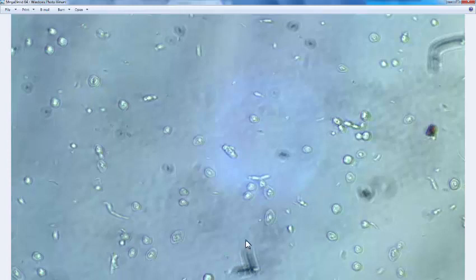probably, brewing or Saccharomyces type yeast, possibly there. A bit of a different style or shape of yeast here, which has got more condensed contents.